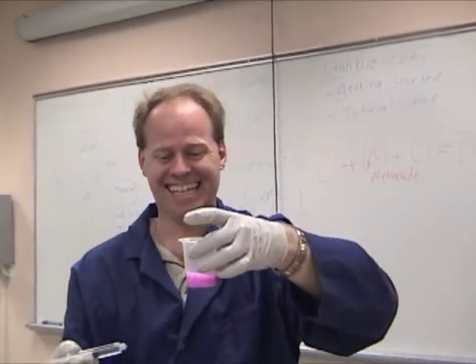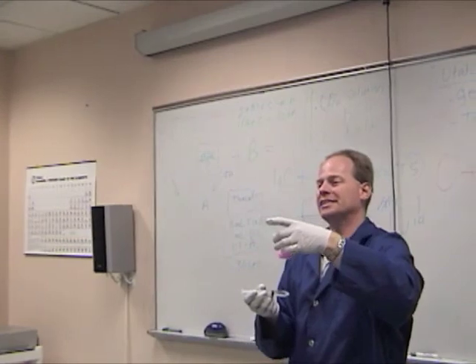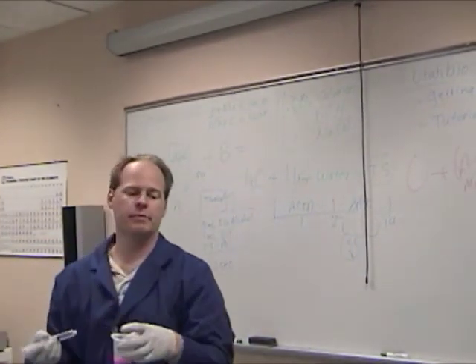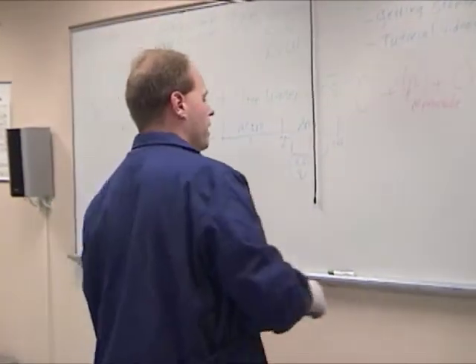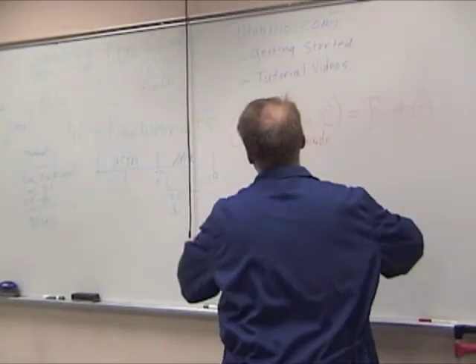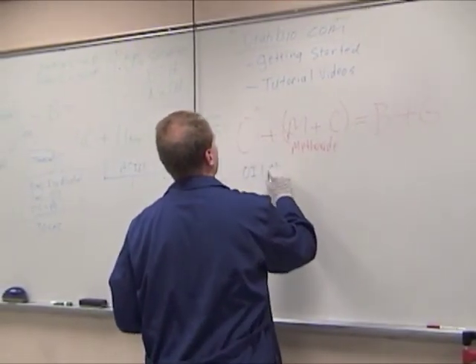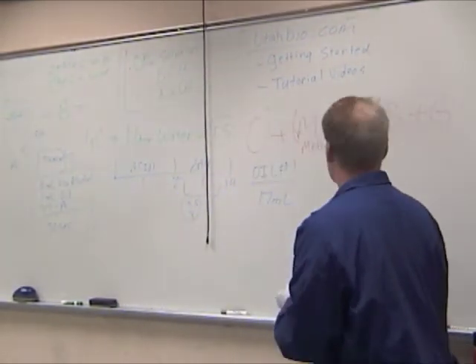You told me to bring some. Yeah, you did. Oil. That's perfect. That's what we wanted. If I was doing this in a normal place and I was going to make a lab, I would do this 3 times. But this has got 17. So I'm going to write oil number 1 took 17 milliliters.